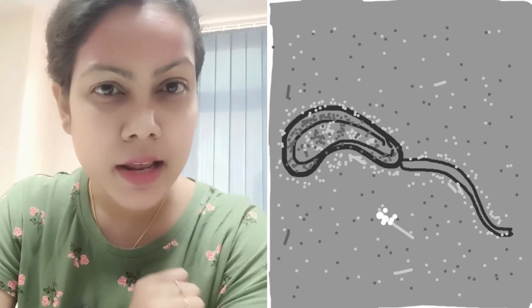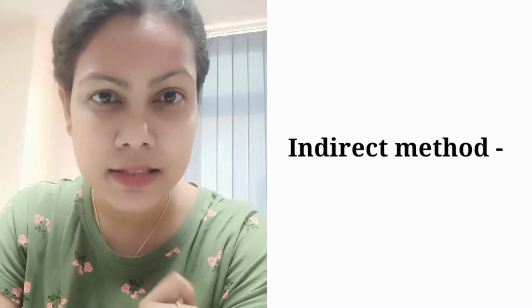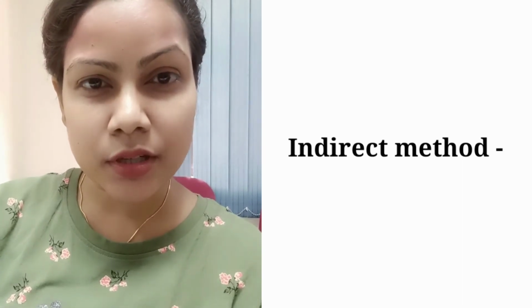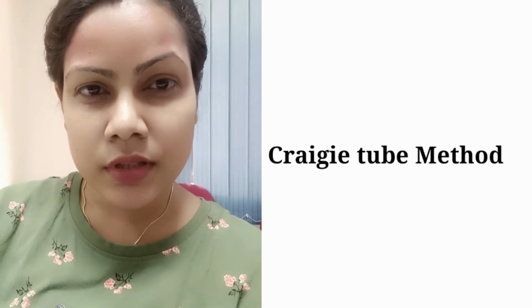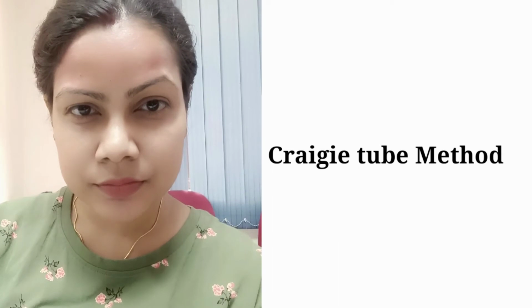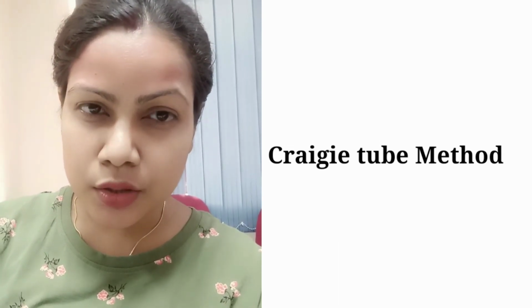Now, next is the indirect method for flagellar detection. For this, we use the Craigie tube method. How will we perform it? In this method, we use a hollow tube having semi-solid culture media.